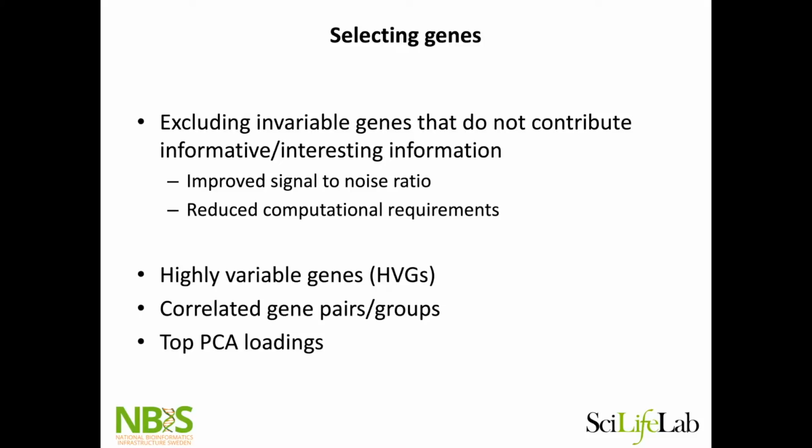And the most common way is to just select highly variable genes. But there are some other methods, like taking top PCA loadings or correlated gene pairs and so on. I'm not going to go into those.